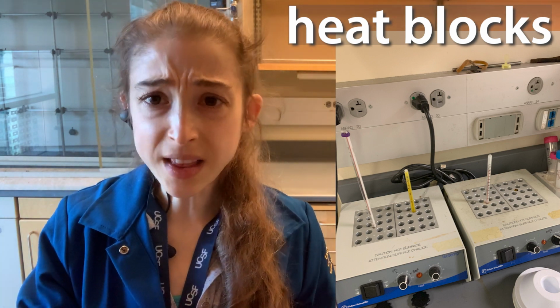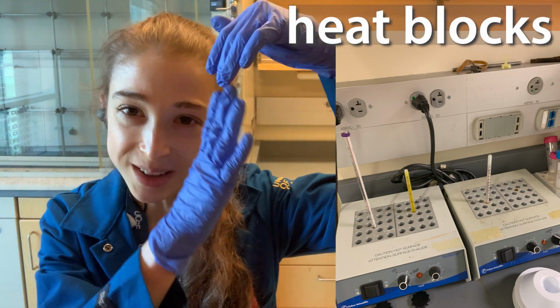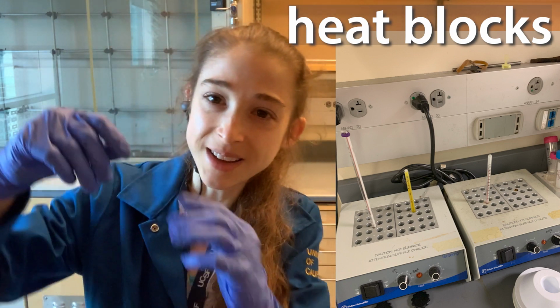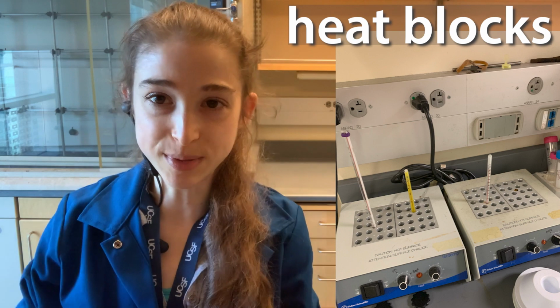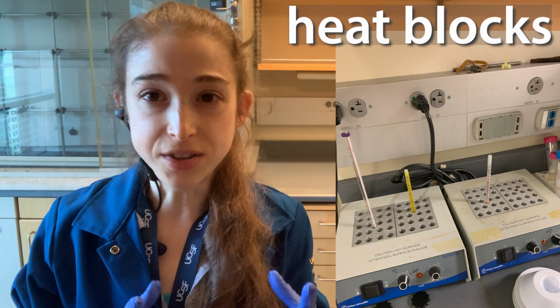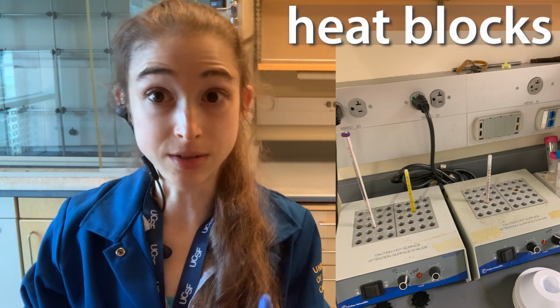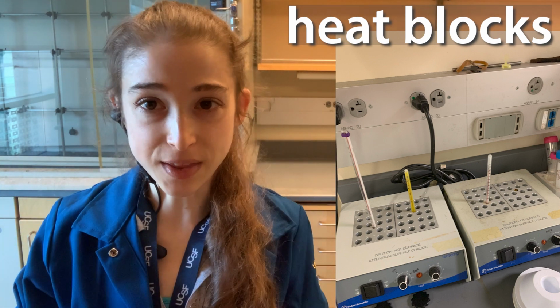You have a knob that you're trying to dial to the correct temperature, and a thermometer in the sand, and you're trying to wiggle things, and there are pieces of tape that say go here if you want this, and go here if you want that, but the thermometer is not agreeing. Yeah, it can be a mess. But this can be really good if all you need to do is boil a sample for a gel. The heat blocks are really great for that, and if you can get them to the temperature you want, they work well for the other purposes.